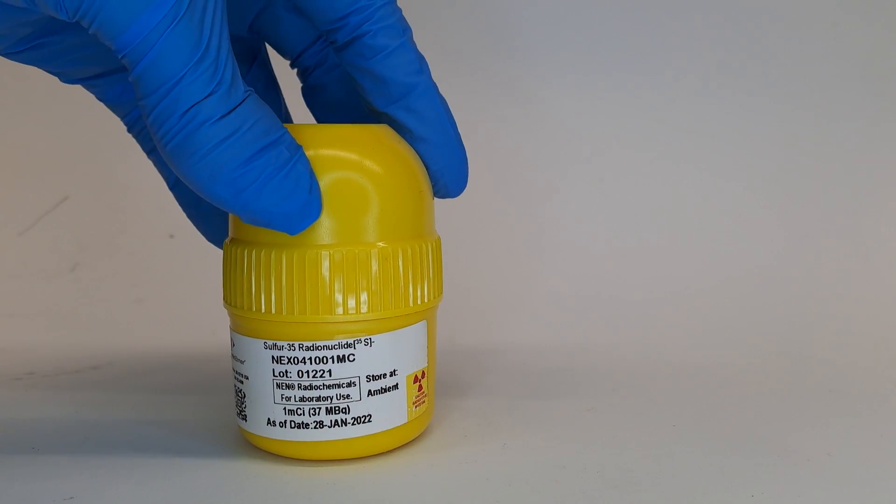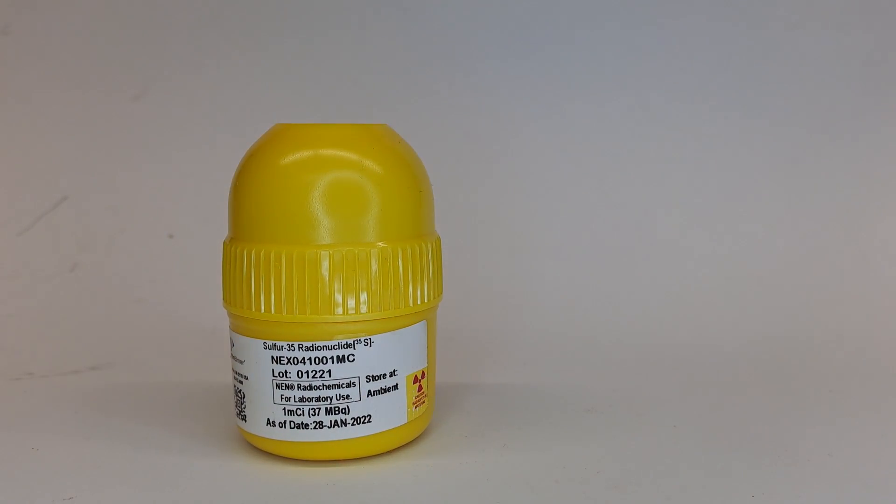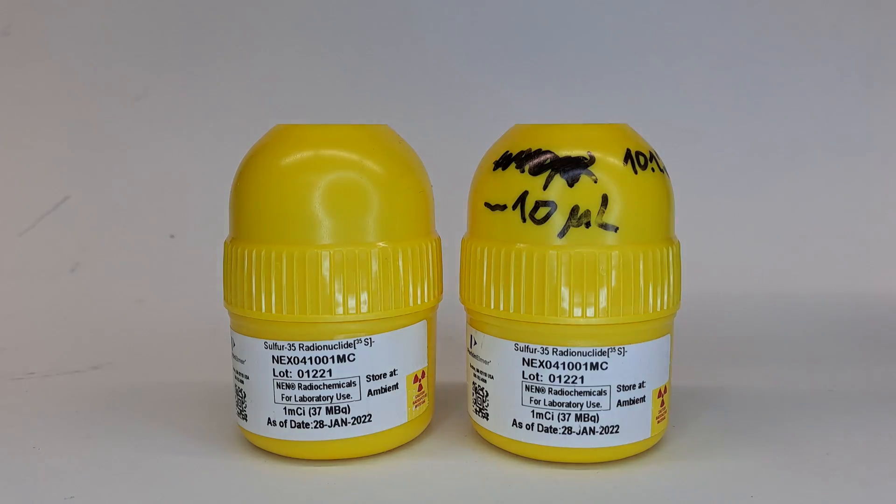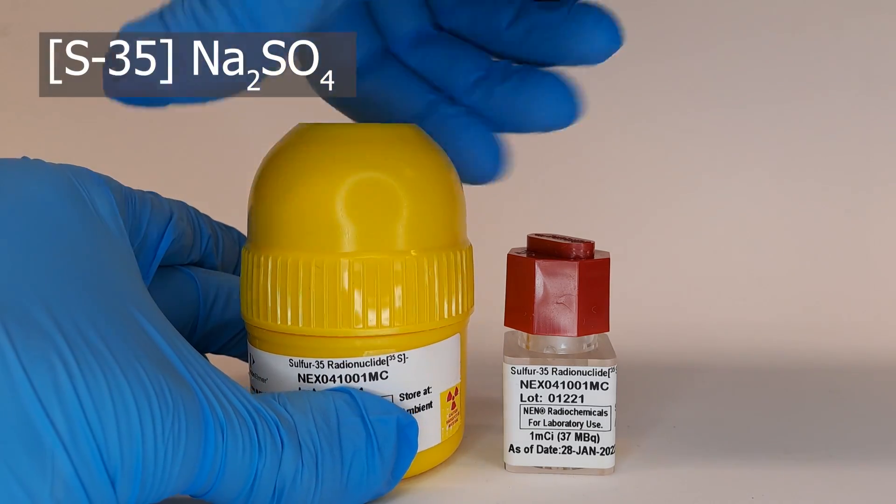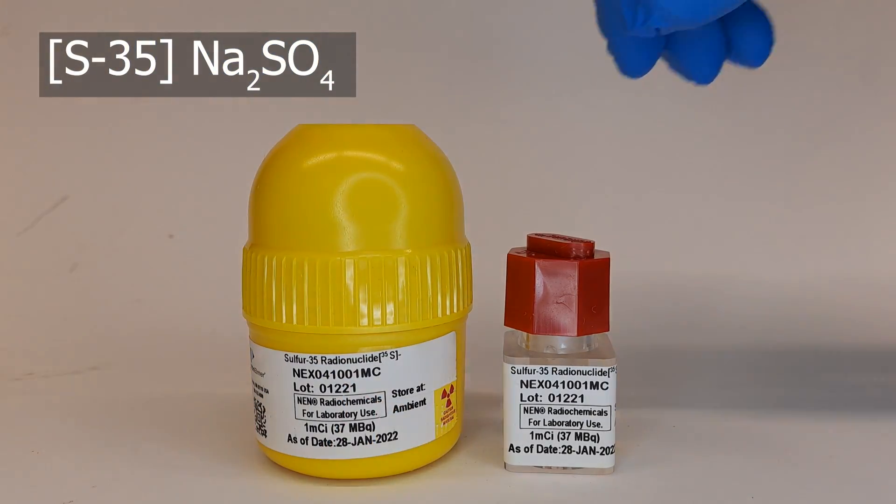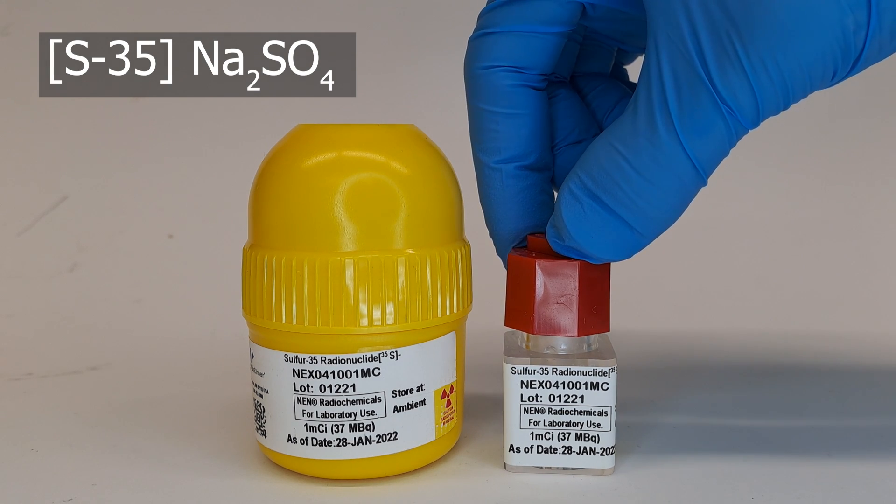A short overview on the radionuclide Sulfur-35. This is a solution of Sulfur-35. This nuclide is a beta-only emitter, meaning there are no gamma lines associated with the decay of this nuclide.